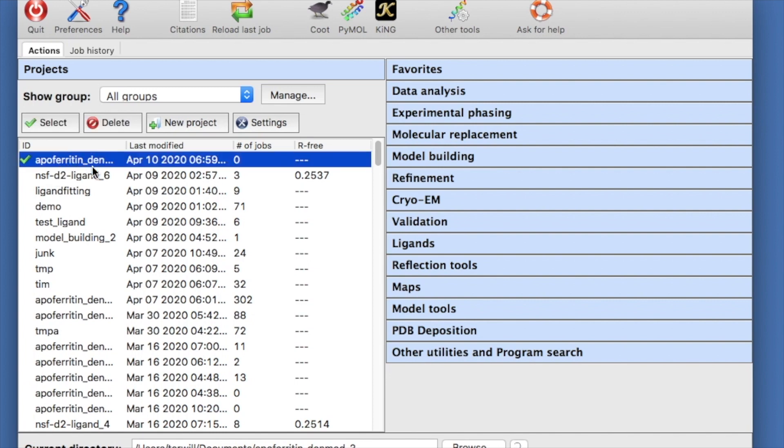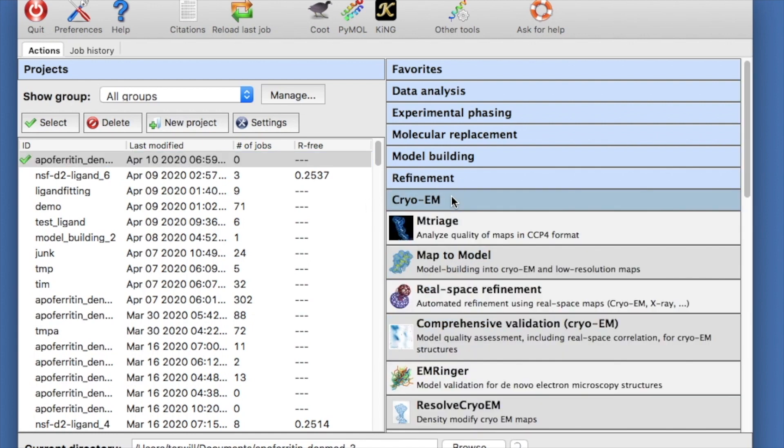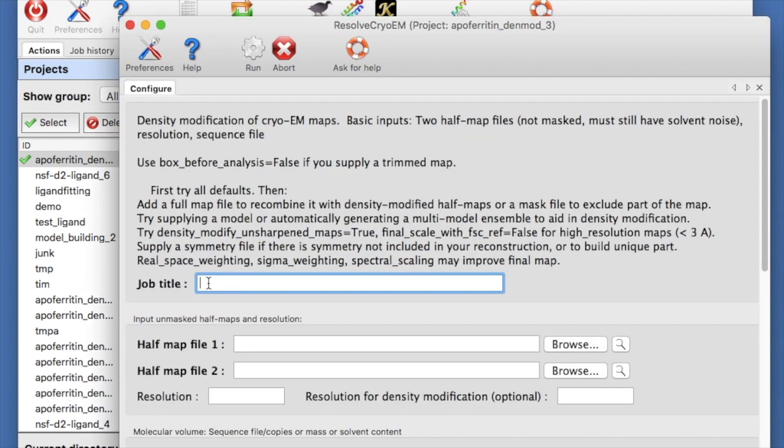Let's run density modification now. Click on Cryo-EM to show the Cryo-EM tools. Scroll down and hit the Resolve Cryo-EM button to load the Cryo-EM density modification tool.